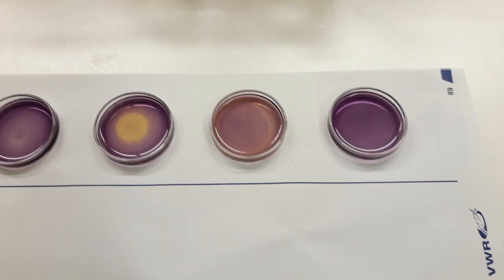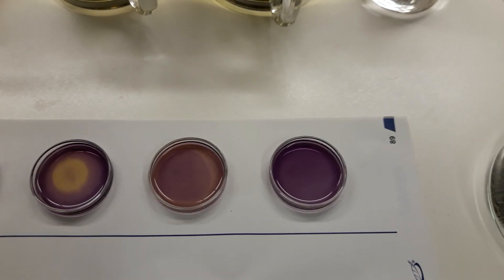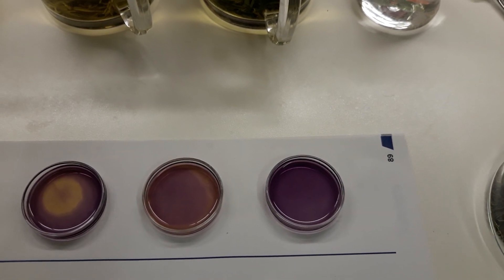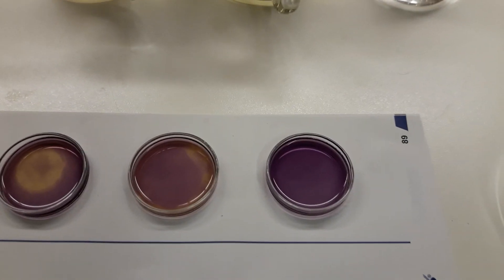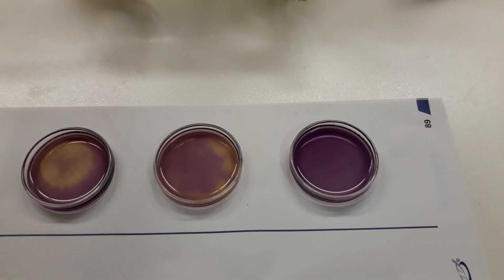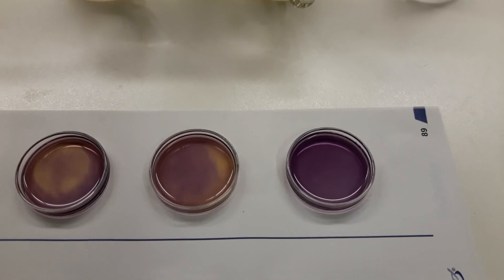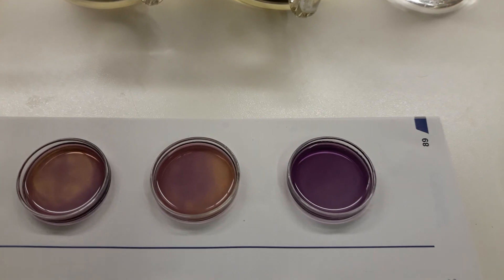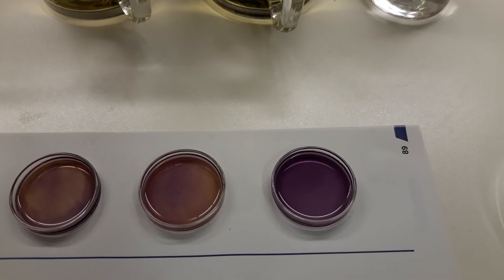Practically what is happening is that this free radical is demanding some electrons to become stable, and what the green tea is doing is giving these electrons to the free radicals to make them stable. This reaction is changing the color of the DPPH. By measuring the change in color from purple to yellow, we can observe the antioxidant power of the green teas or any material whose antioxidant capacity we want to measure.